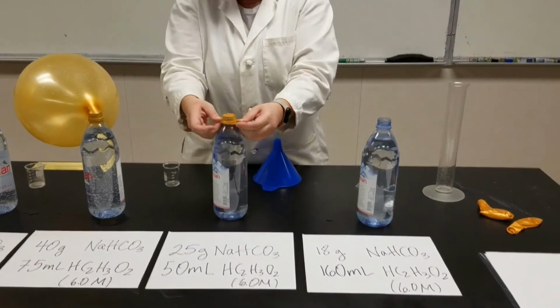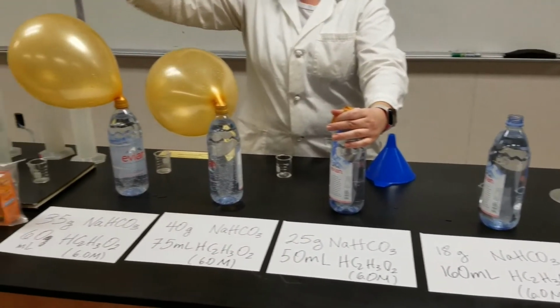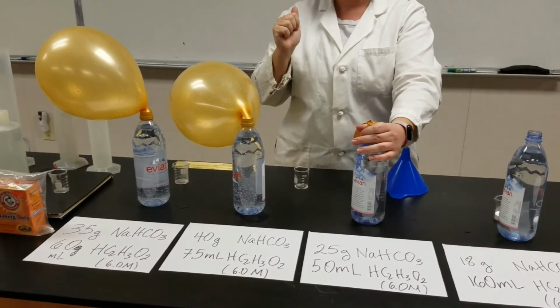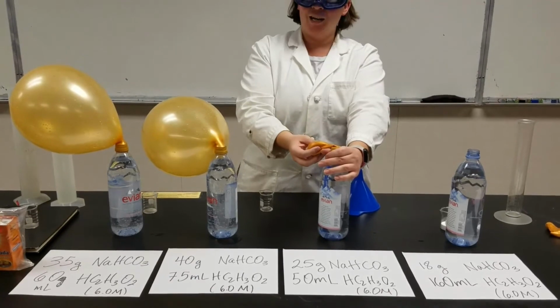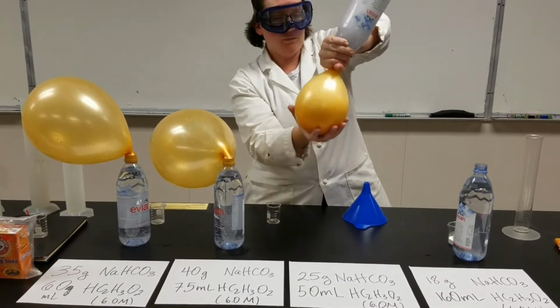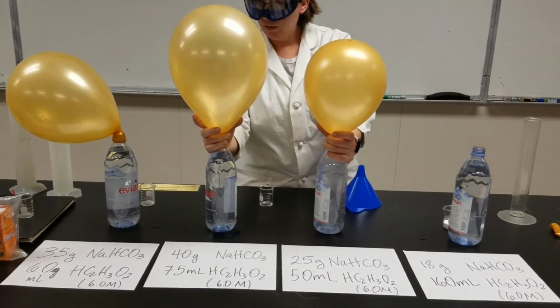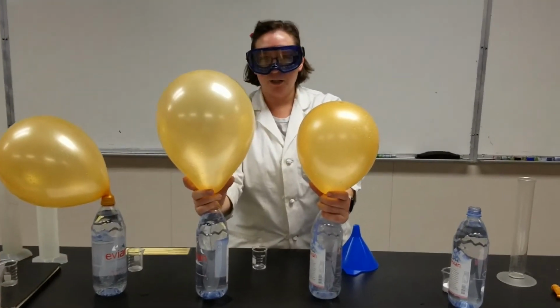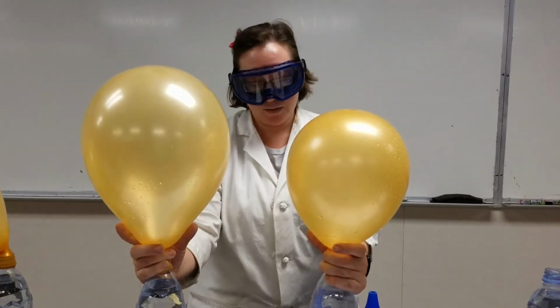Make a prediction as to the size of this third balloon compared with number 1 and number 2. All right, now here we go. And how does this one compare? Does that meet with your hypothesis?